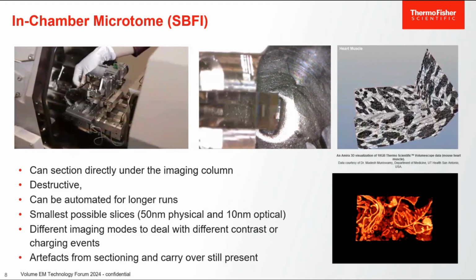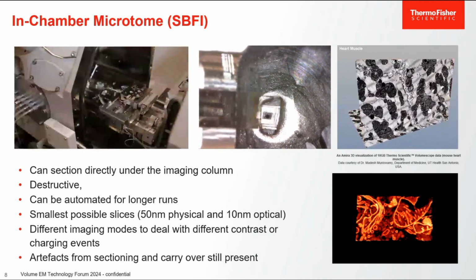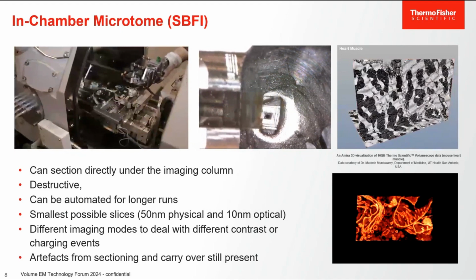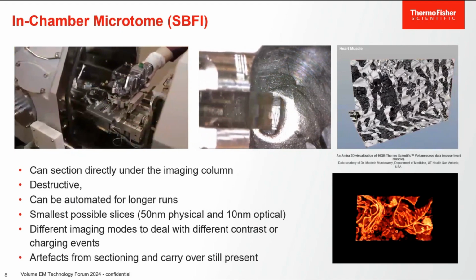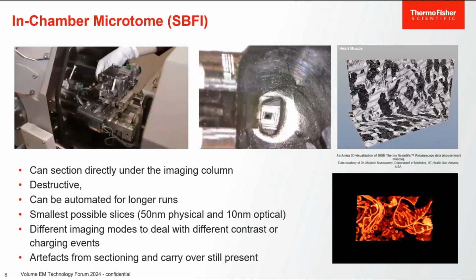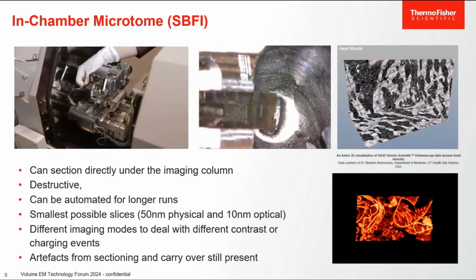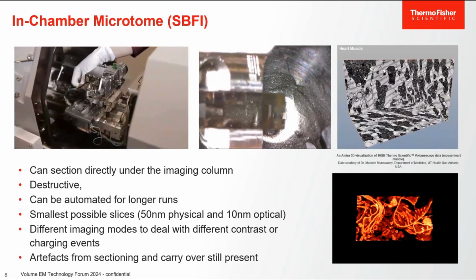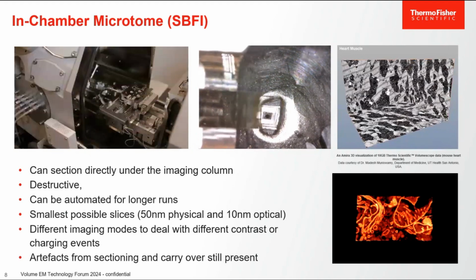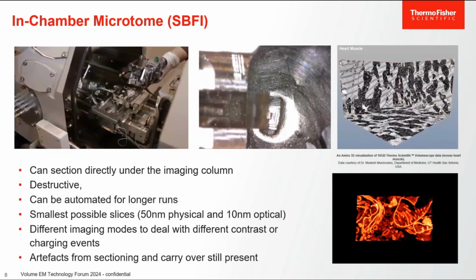This is very nice. I mean, it gets rid of you having to do this sitting by a microtome externally. You can trim the block to improve the performance of this, and then you can leave the system running. And we have some people running the system for, I think the record was 8 weeks. We've had it running constantly with a job to acquire data from a whole millimeter of material. So this is very nice if you can afford 8 weeks of full time to do a job. But as I say, for the right question, it's a very nice technique.